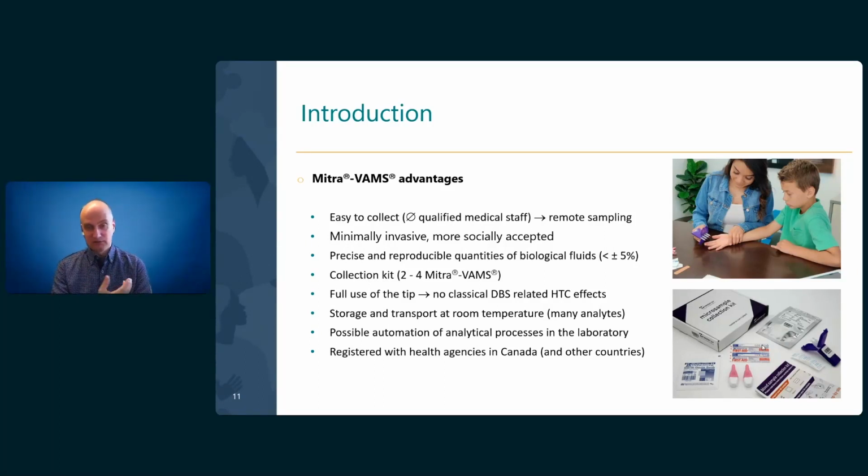And obviously, this allows remote sampling, either at home or in the field. Let's say you have a project running in a remote community, so you might use it. Obviously, it's minimally invasive, and in this way, it's more socially accepted. So it allows you to collect precise and reproducible quantities of biological fluids.